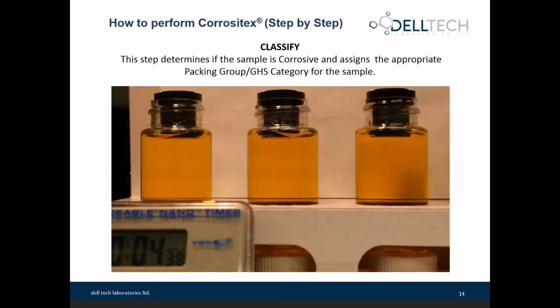And this is a close-up. We'll look at the center vial here of that sample that we just pipetted. And you should start to see right there a pink liquid start to come through, and that's your endpoint. We would have noticed it was about 4 minutes and 30 seconds was the breakthrough time. Of course, we started the video late. We didn't want you to sit here for 4 minutes watching it.